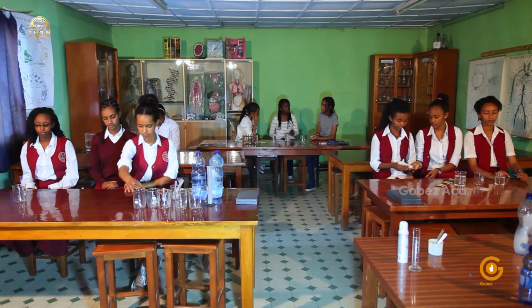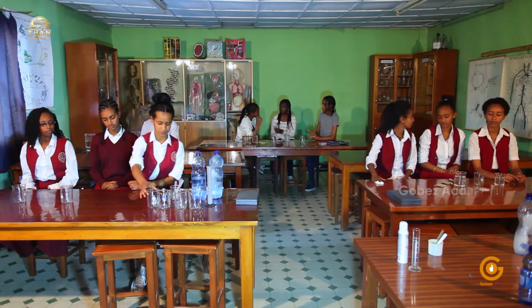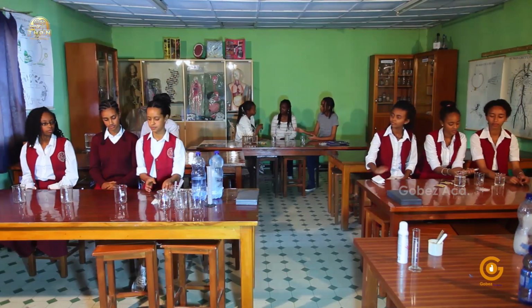While we are still on diffusion, let us look at the rate of diffusion in water. For such an experiment, we require 3 beakers. On the first glass beaker, I write tap water on it.